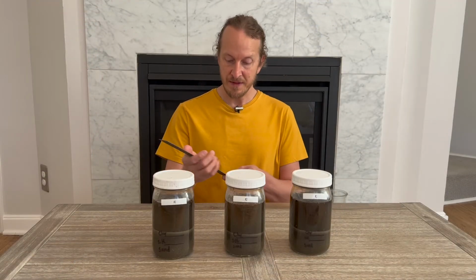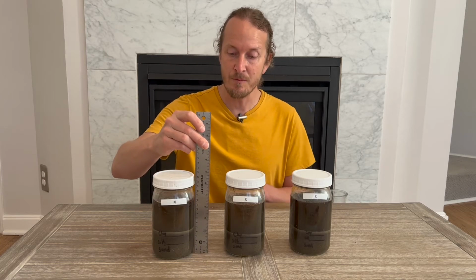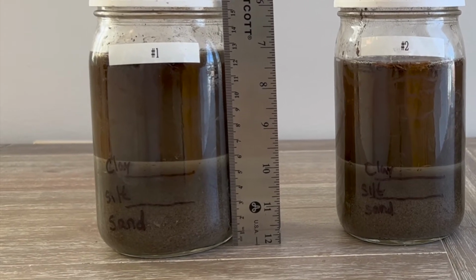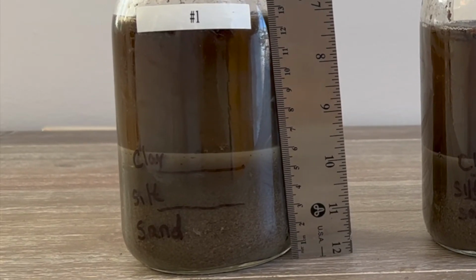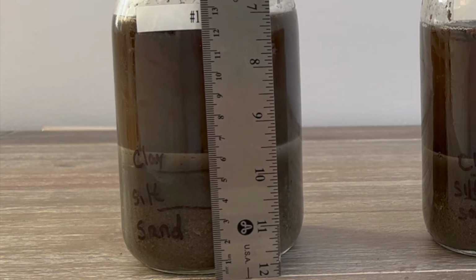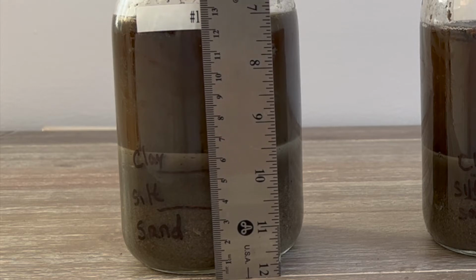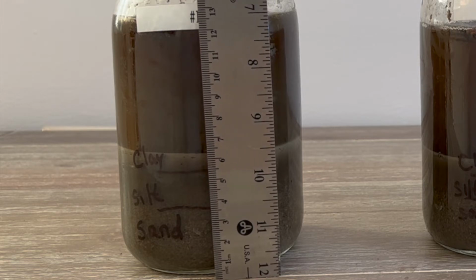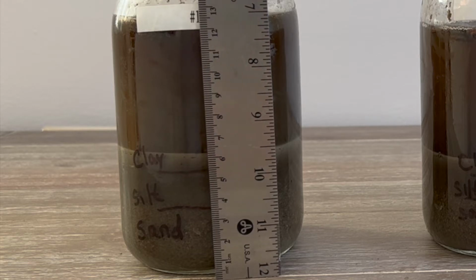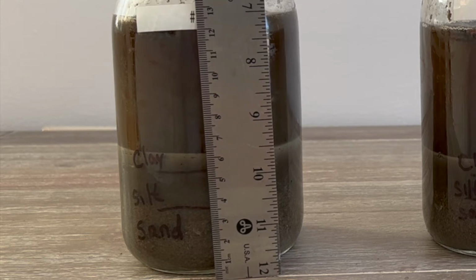So the next thing is to take a ruler, and we're going to measure exactly how much of each of the layers there are. In this first sample, we have a total of about 60 millimeters. When I look at the different layers, the sand is 36 millimeters, the silt is 16 millimeters, and the clay is about 8 millimeters.